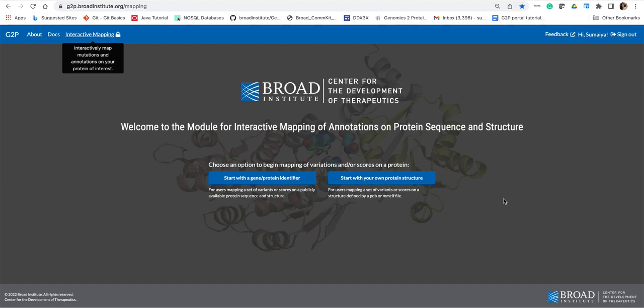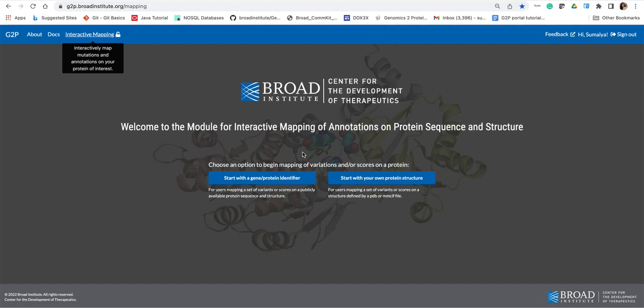For this tutorial we will use the 'start with your own protein structure' capability because we will analyze a non-human protein structure. Note that when users start with a gene or protein identifier capability, the portal now accepts only the human gene or protein identifier.